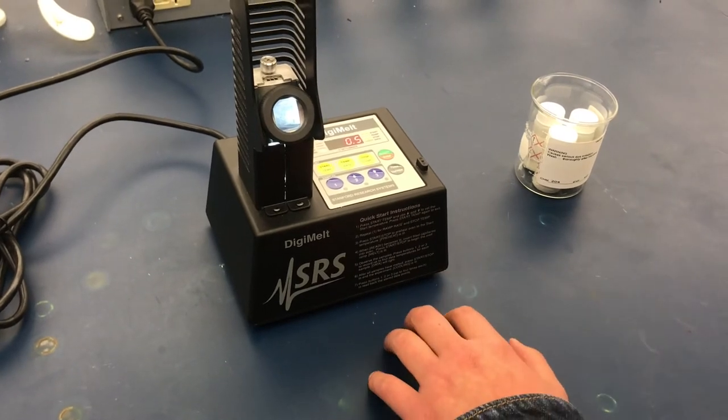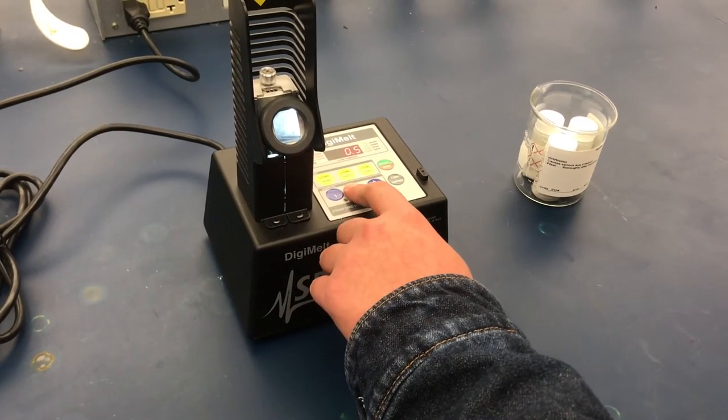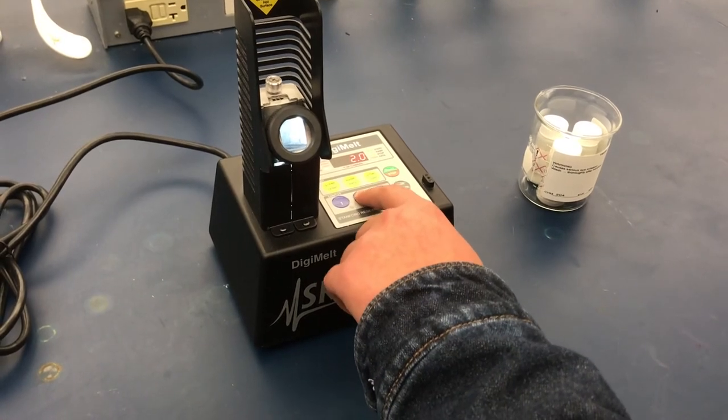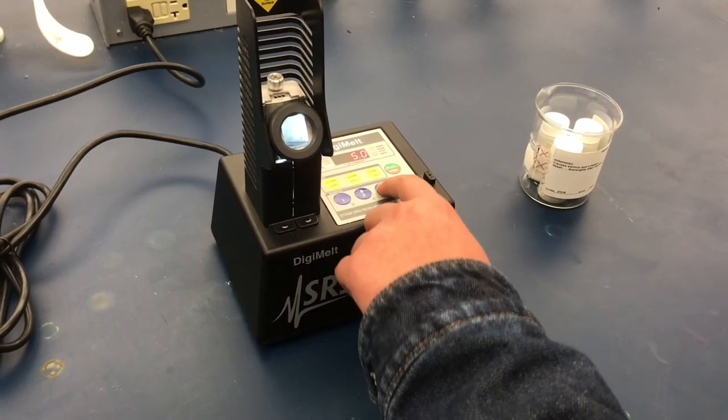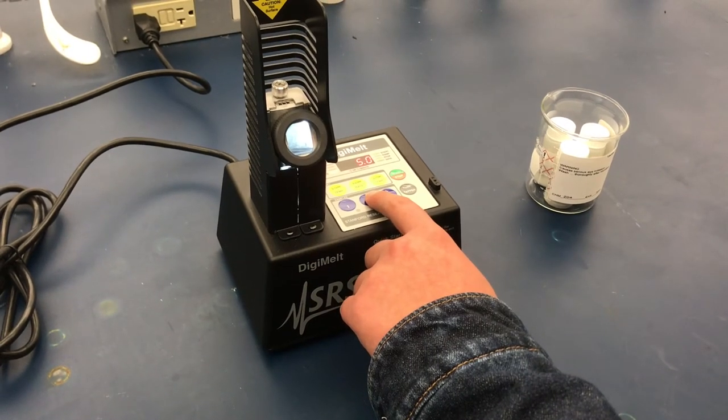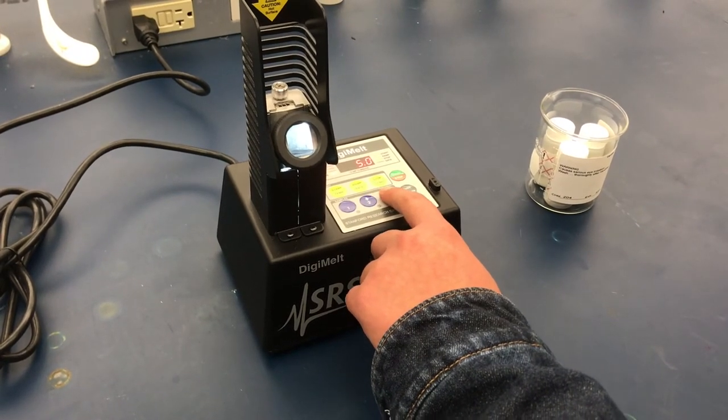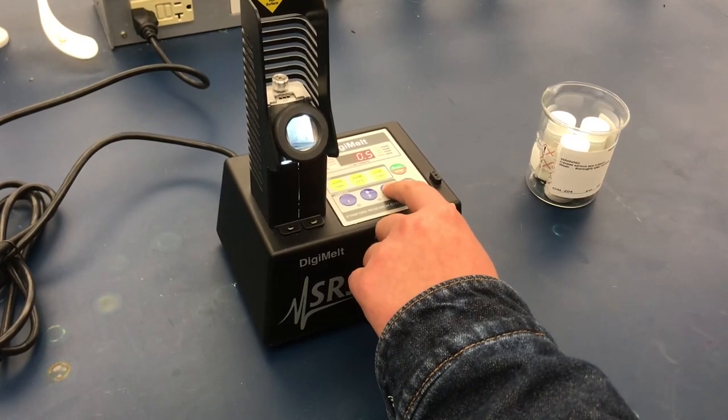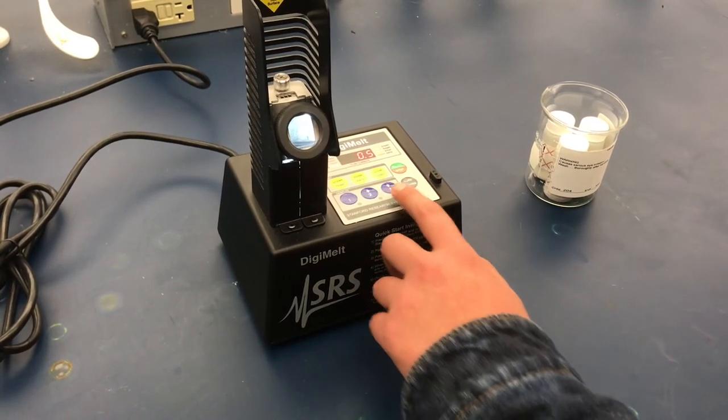Then press ramp rate. If this is your first trial or you are unsure of the melting range, adjust the ramp rate to five degrees Celsius per minute or more. For the second trial or if you know the melting range, set the ramp rate to one degree Celsius per minute or 0.5 degrees Celsius per minute for better accuracy.